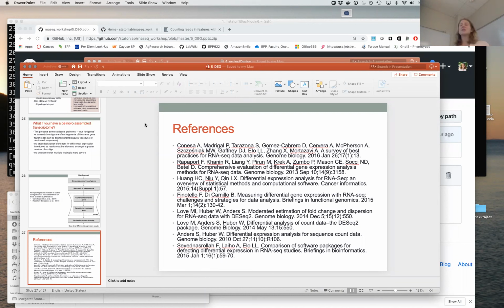We did some sequencing of a blueberry species, and there was a reference genome for a different species. We mapped the reads back, and we were getting like 50 to 60% mapping. And we had this really big debate. Is that good enough? Is using the reference and losing 40% of our data better? Or is it better to try to do a de novo assembly and map our reads back?